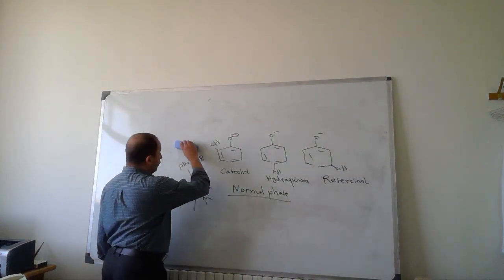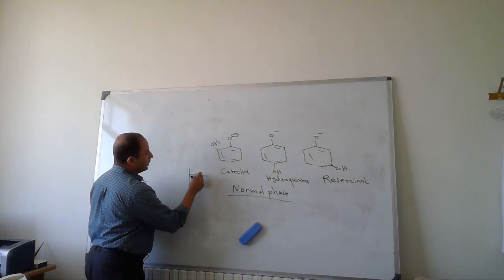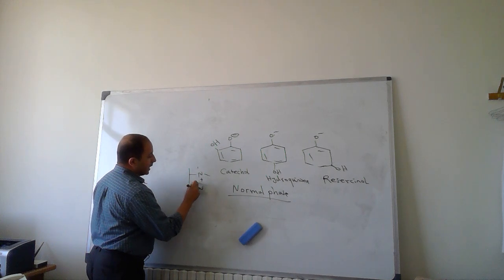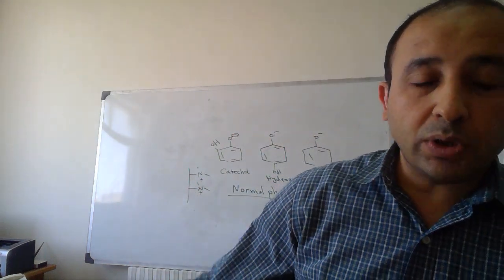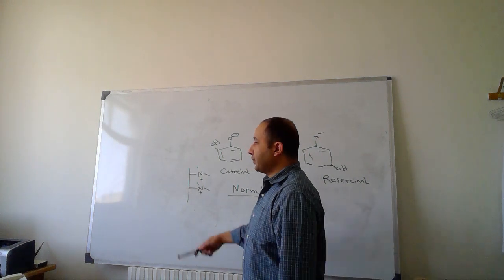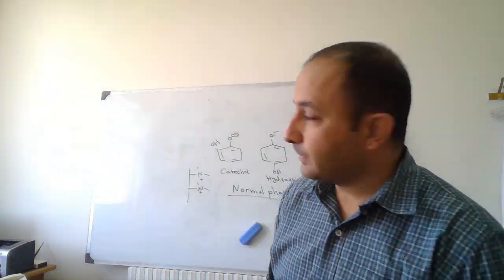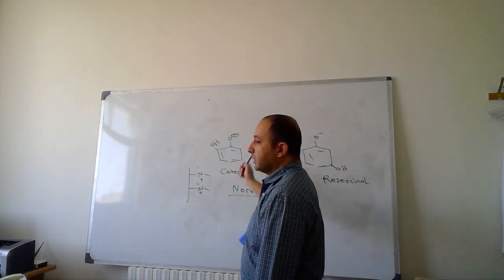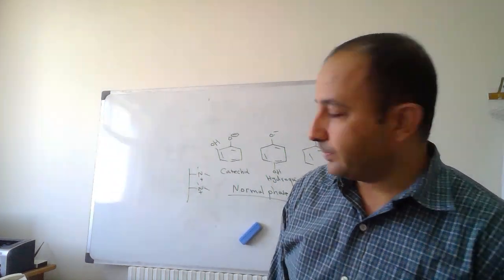Accordingly, this polymeric-based stationary phase tolerates a wide range of pH, from 1 to 14, for example. So we can increase the pH above 11 in order to get these molecules ionized. But the problem is that all of them will be monovalent, with just one charge. So again, there is no chance, even by using ion exchange, to get these compounds separated.